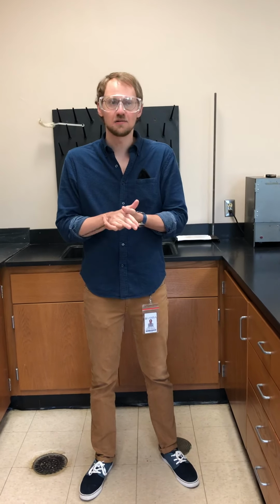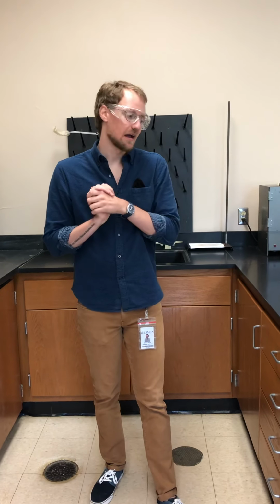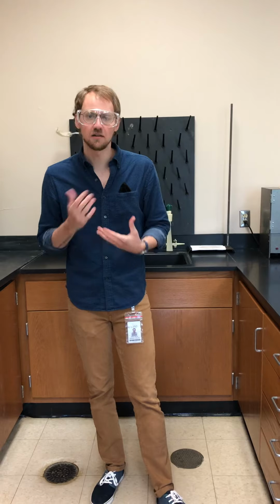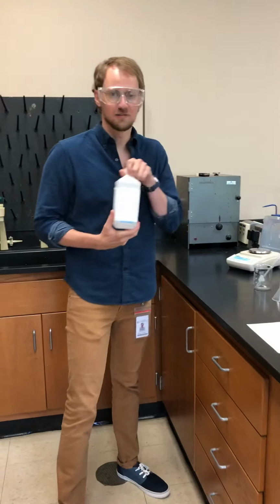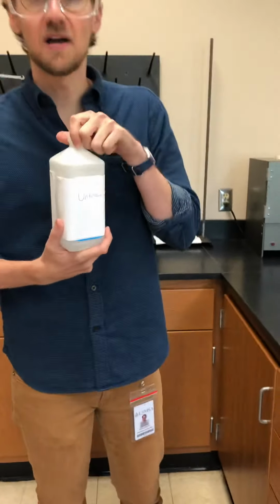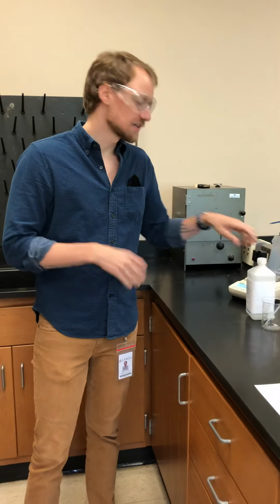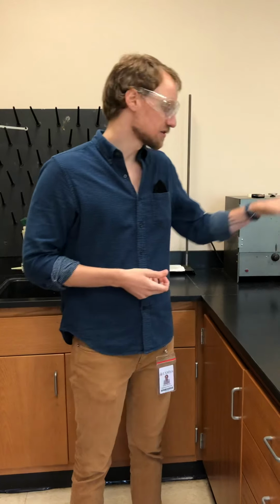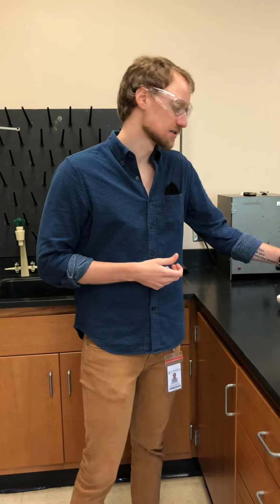So we're going to continue with measuring density of liquids. You saw in the last video how we measure the density of water. We're basically going to do the same type of thing with an unknown liquid now. So we have this bottle of some unknown solution. We're going to measure the density of the solution. Then you're going to use our calculated density, compare that to your table of known densities to determine what the substance is.